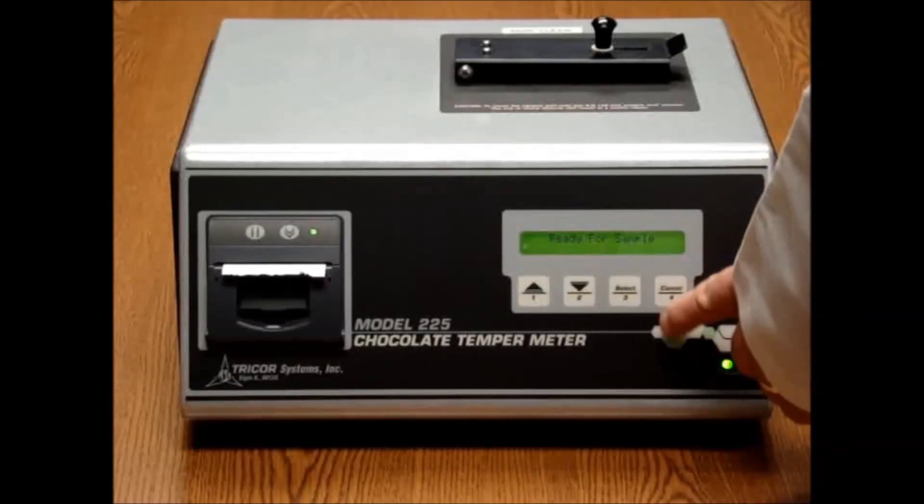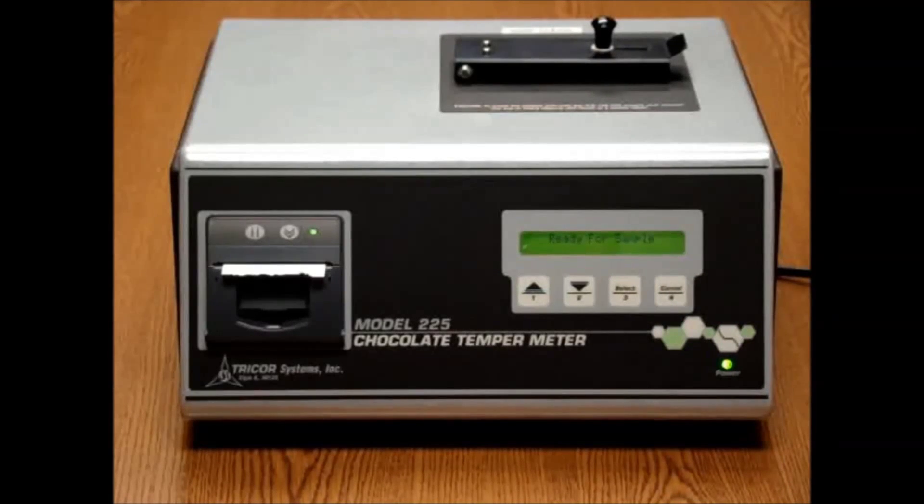From here, we are going to press cancel to get out of the main menu and back to the ready for sample screen.